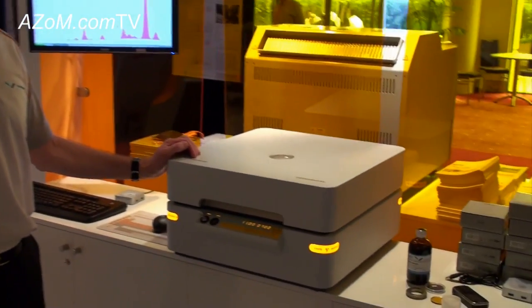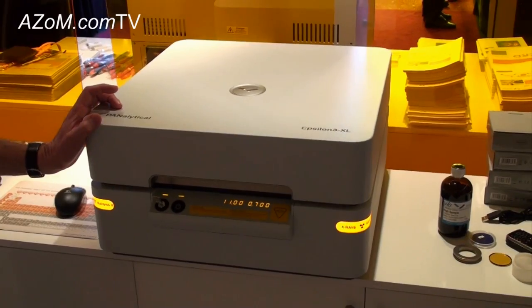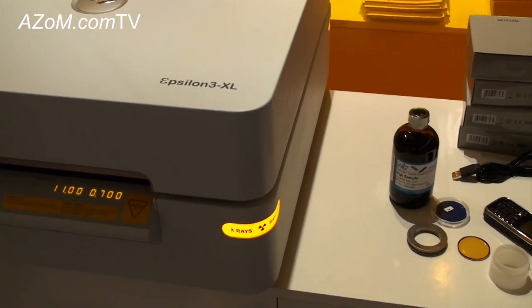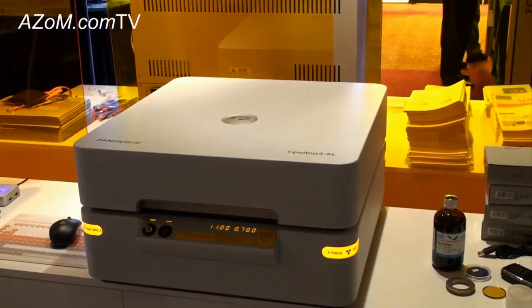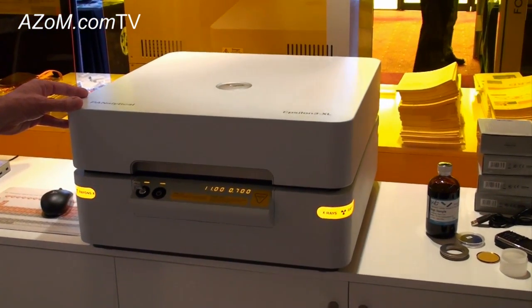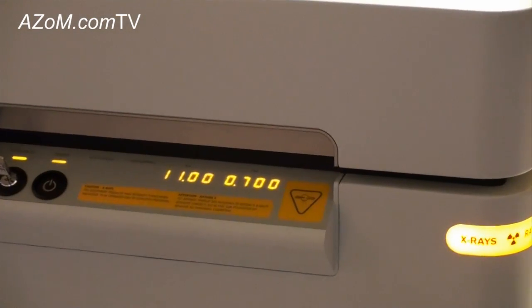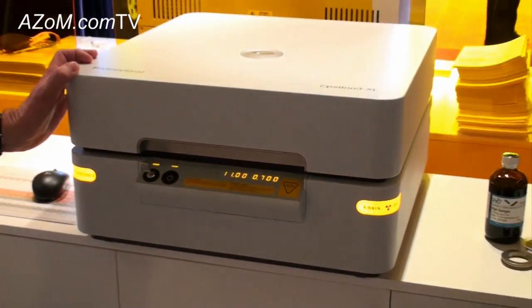Here we have brand new to Panalytical's product portfolio, launched a week ago. This is the first public display of this unit. It's an energy dispersive spectrometer, and one of a range of two. The system is designed to analyse a variety of materials from a variety of different industries — for example, cement, petrochemicals, mining, and polymers and plastics.